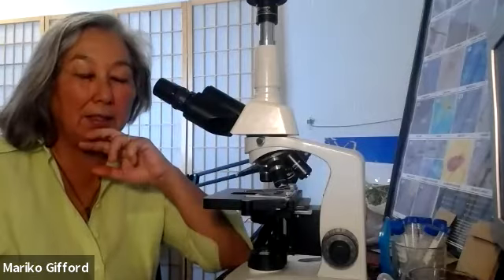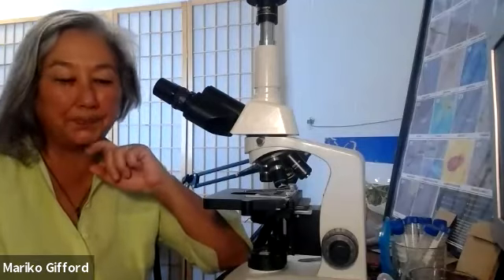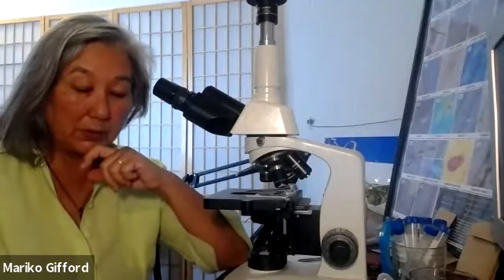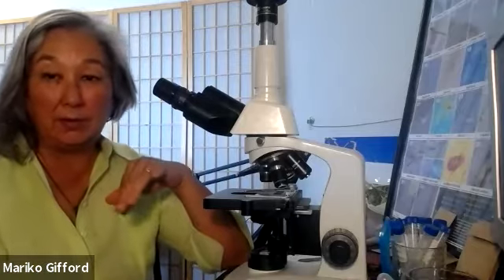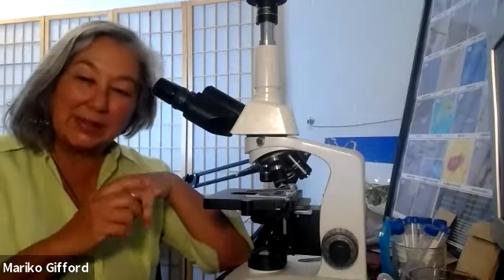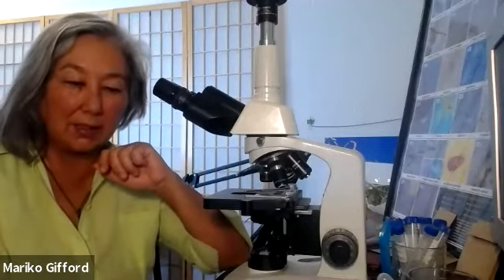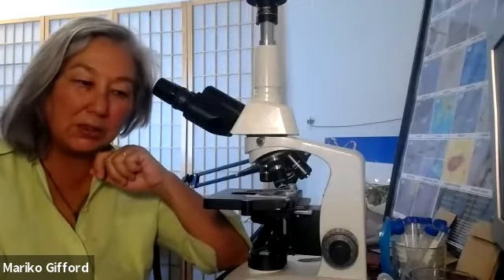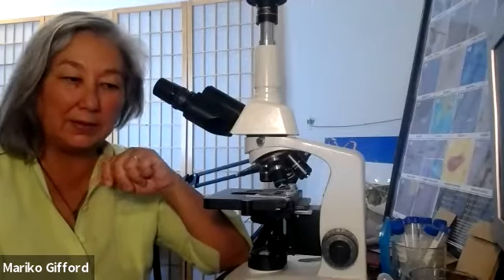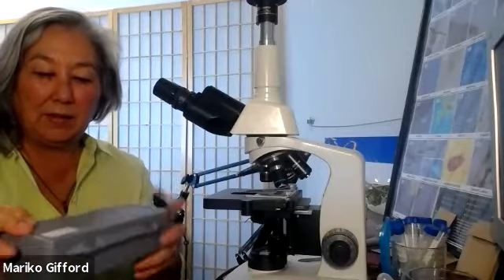And you can check it on their website if you buy it from them, and there are charts out there, and we'll have it as our resource where you can look at a lot of different fruits and vegetables that they've measured, you know, fair, good, and very good. And you can see just an indication. So without having more technology than that, you have a baseline piece of information that you can take right out in the field, and it comes in a pretty sturdy carrying case.